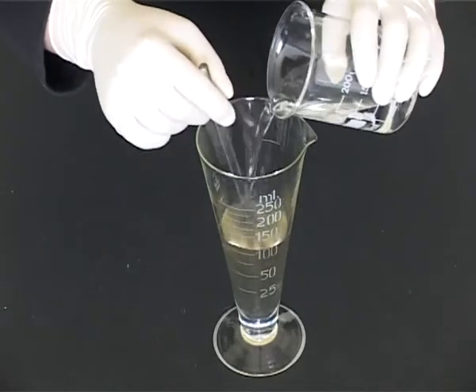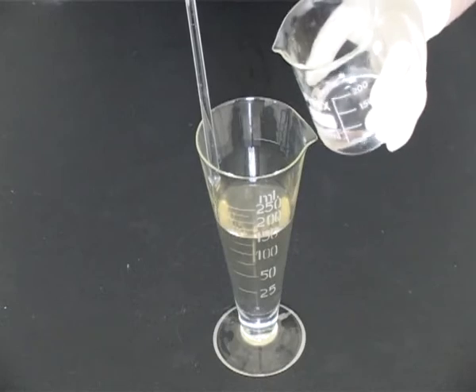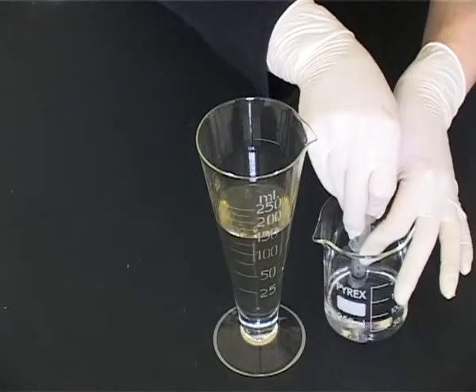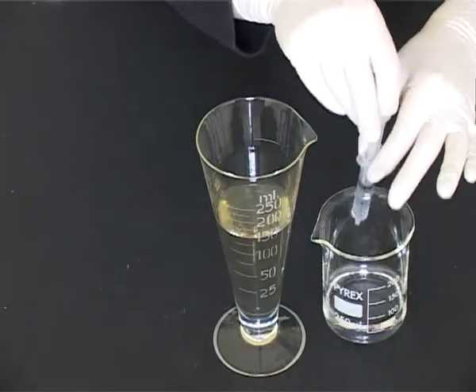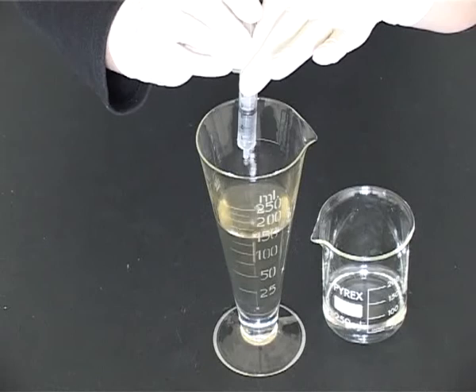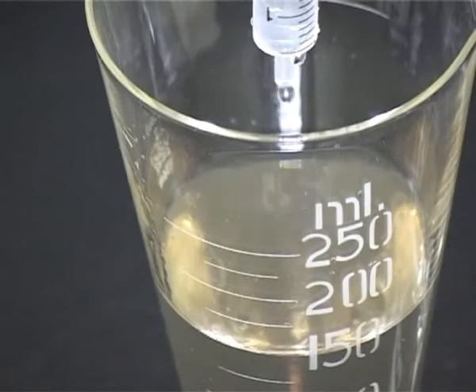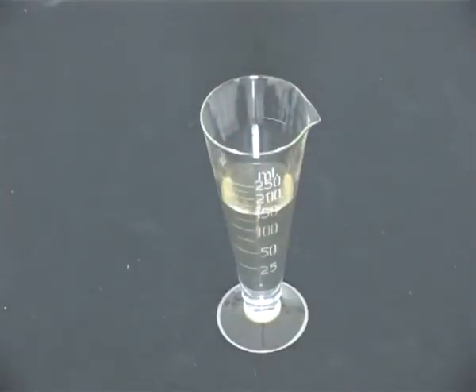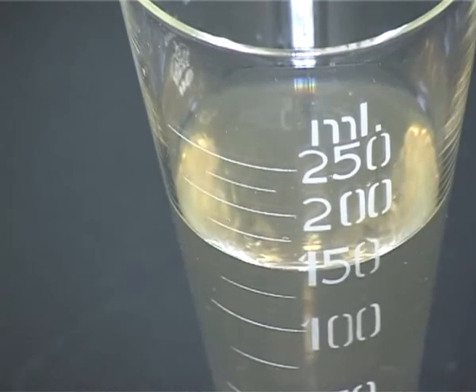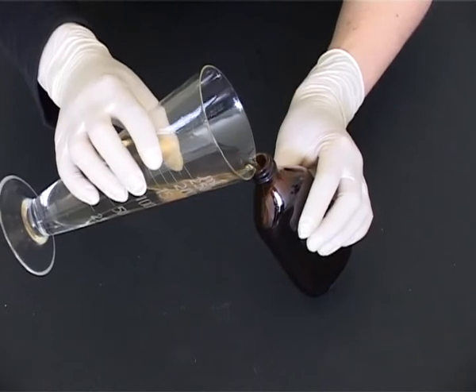Stir and then add the appropriate vehicle to make up to volume, remembering to remove the stirring rod. Transfer the solution to an amber, flat, medical bottle with a child-resistant closure.